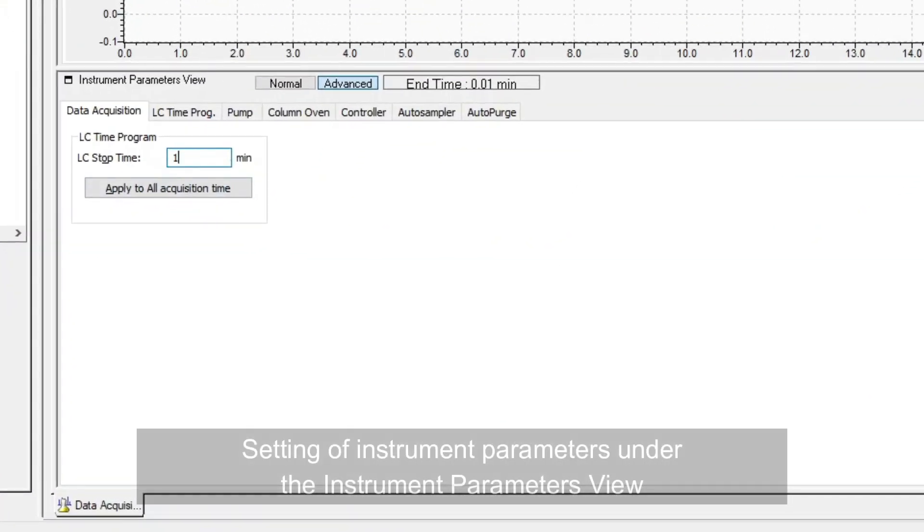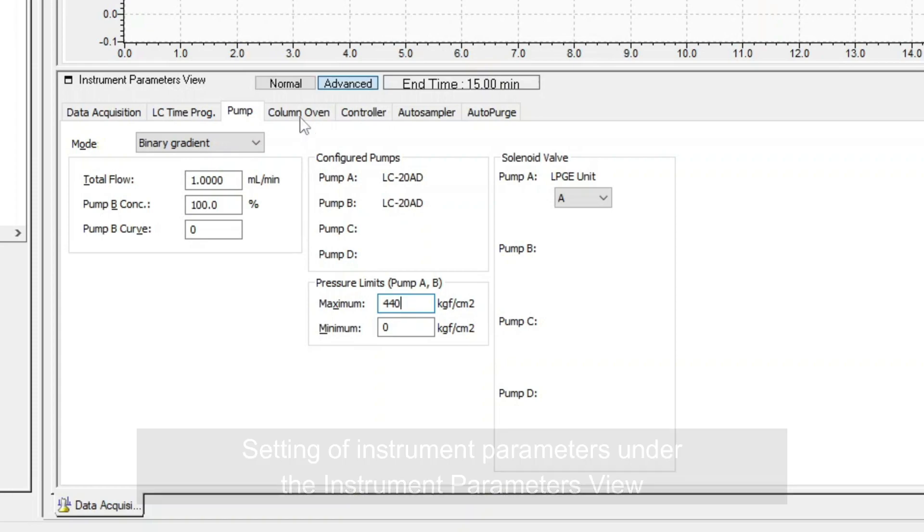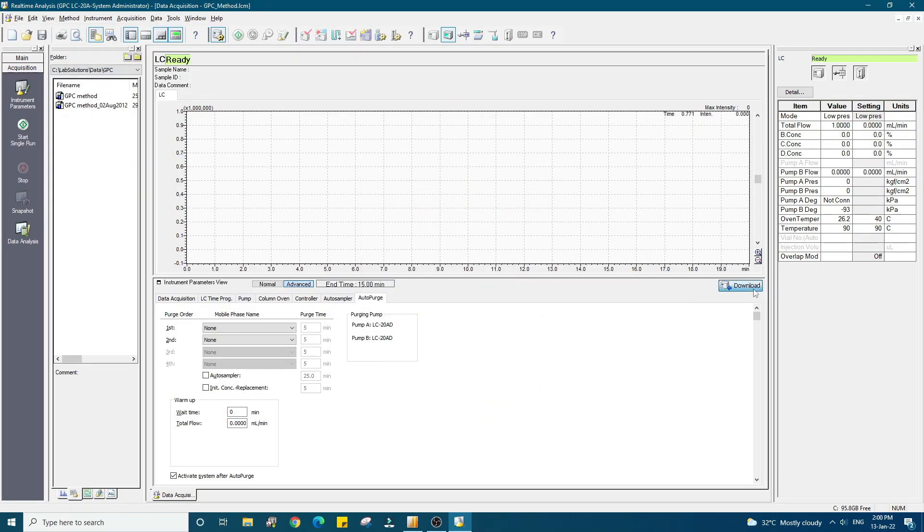Under the instrument parameters view, set the parameters of each component one by one to create a GPC method file. Save the method file and then download the parameters.